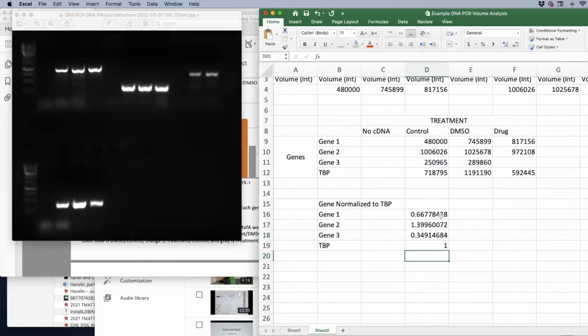Cool. All right, so now we're going to copy the formula I just used, paste it over here, so that's what we're going to do to make this a little faster. But now if we click on this, remember I put those dollar signs in, so it locked it in place when I copy and pasted. You can just drag it over. Now with the dollar signs in place, it's saying it's going to lock onto this cell.